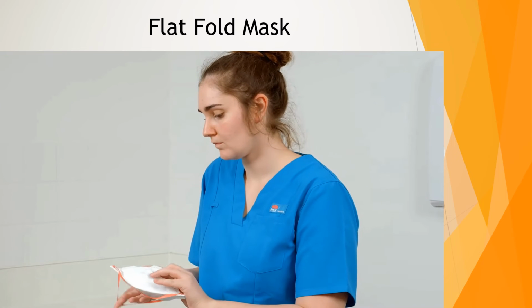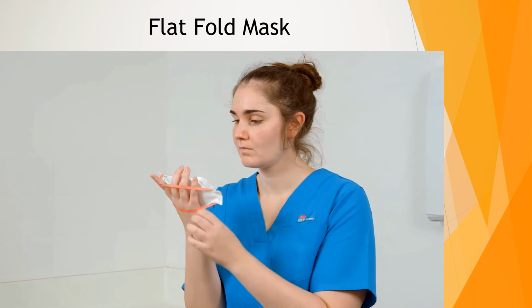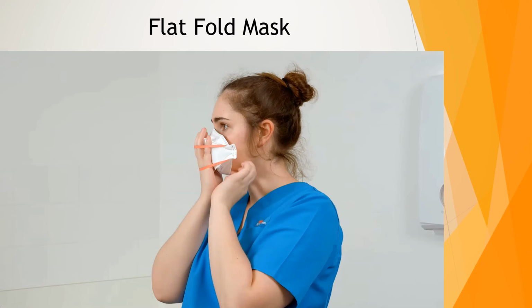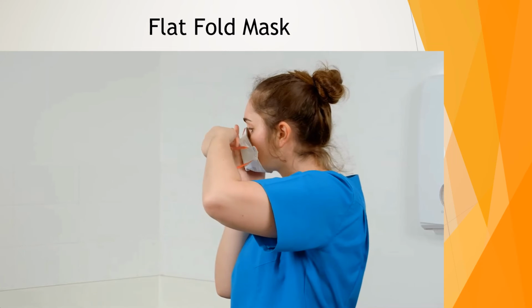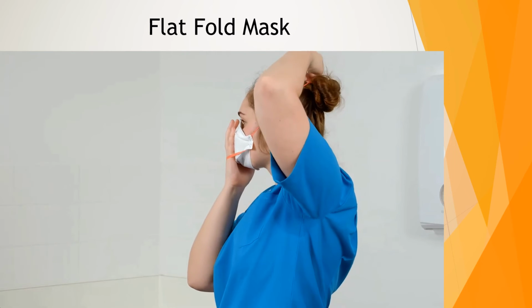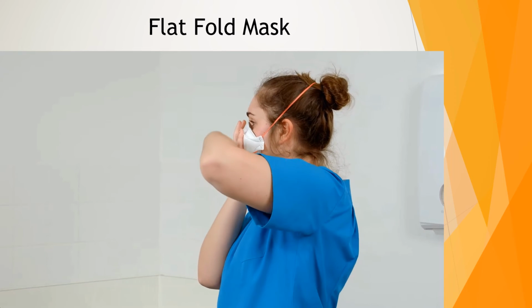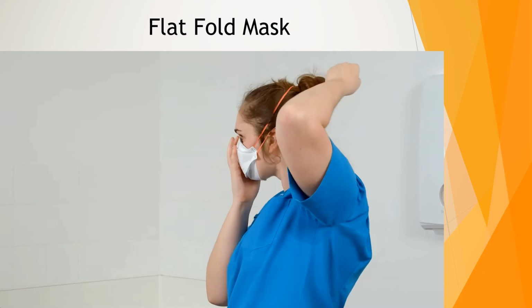Cup respirator in one hand with open side towards face. Place the respirator on your face so that the foam rests on your nose and the bottom panel is securely under your chin. Hold respirator under chin with nose piece up and pull straps overhead. Pull the top strap over your head and position it high on the back of the head. Pull the bottom strap over your head and position it around your neck and below your ears.